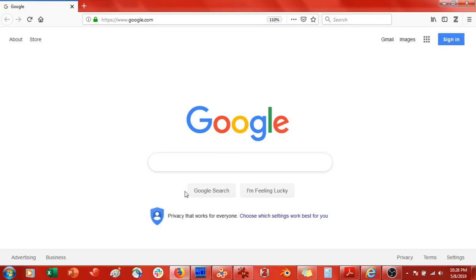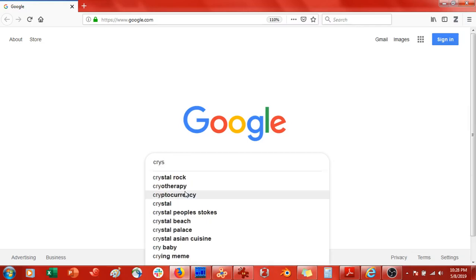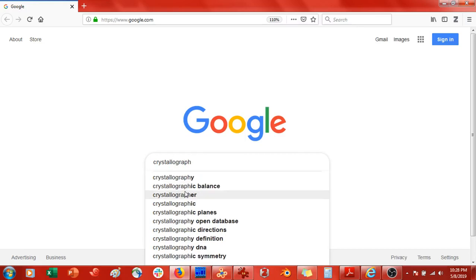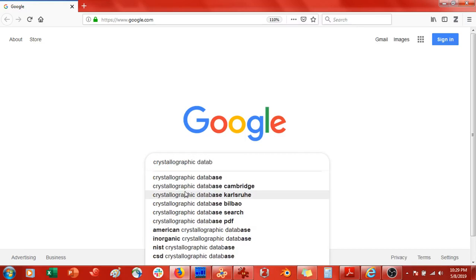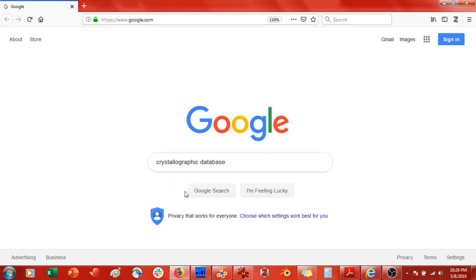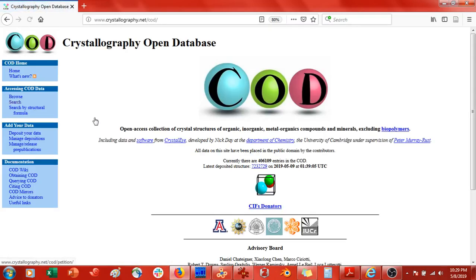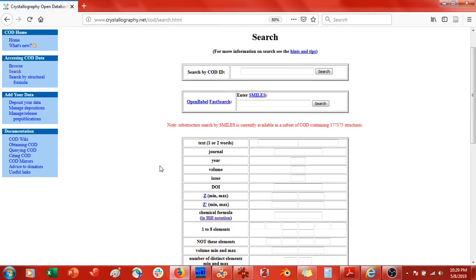What I do is open up a web browser and type in 'crystallographic database'. Then I click on the top result that says crystallography.net. I click on that and come over to the left where it says 'accessing COD data' and press Search.